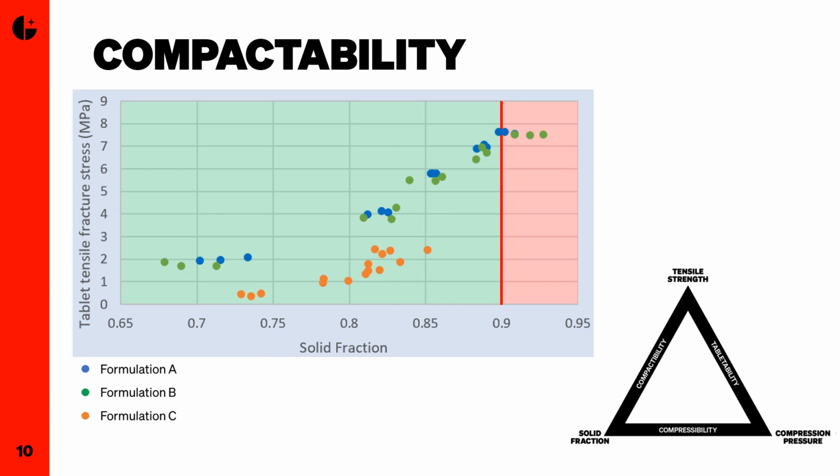The final relationship is compactability, and this is how the tablet tensile fracture stress changes with the solid fraction of the tablet. And this is another relationship that's particularly useful when you're carrying out formulation.